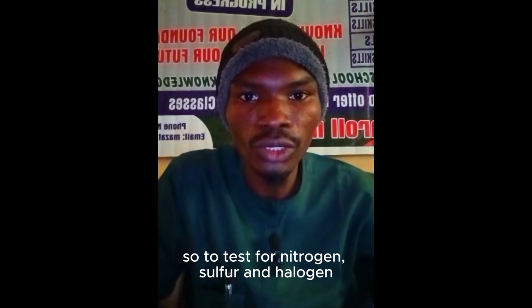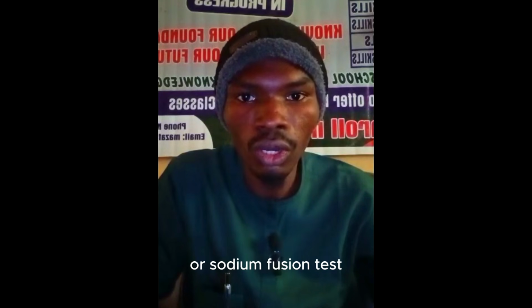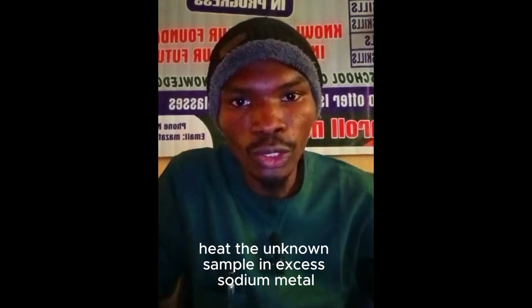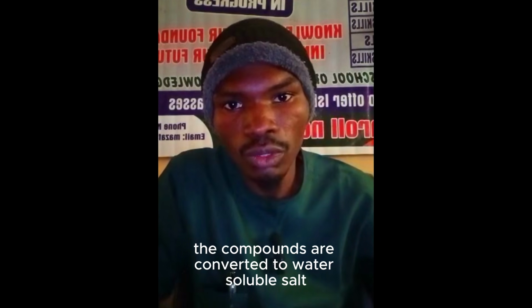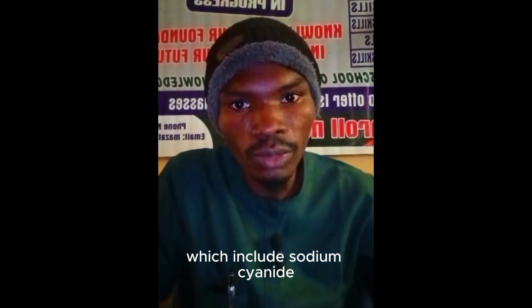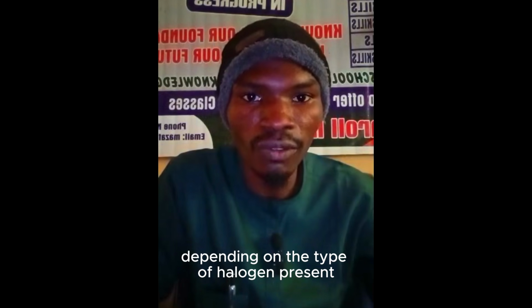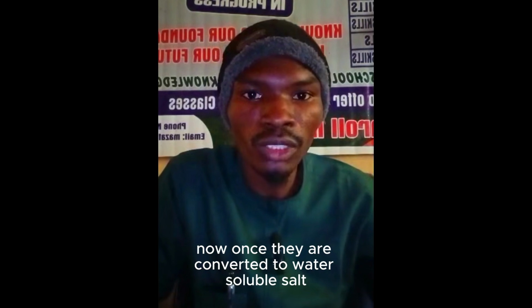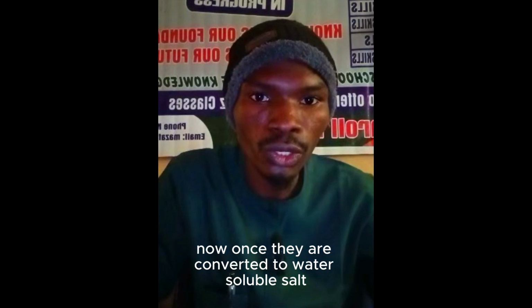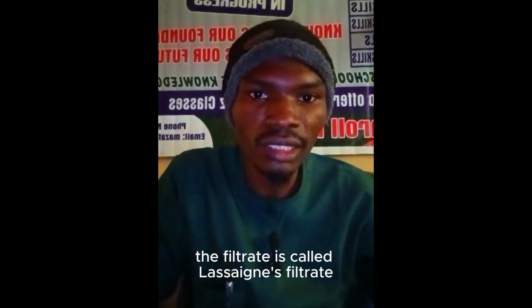So to test for nitrogen, sulfur, and halogen, you use a method called the Lassaigne test or sodium fusion test. Now, in the Lassaigne test, heat the unknown sample in excess sodium metal. The compounds are converted to water-soluble salts, which include sodium cyanide, sodium sulfide if sulfur is present, and sodium halide, depending on the type of halogen present, which could be either chlorine, bromine, or iodine. Once they are converted to water-soluble salts, you dissolve them in water and filter. The filtrate is called Lassaigne filtrate.